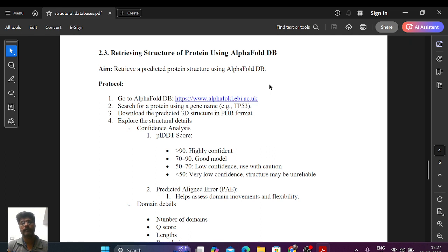Make that work very easy. You can just submit the sequence. They have already deposited nearly, I think, more than 20,000 proteins in the databases. This AlphaFold is a collaborative work of EMBL and Google. They are using the DeepMind algorithm, I think, so it is very accurate.